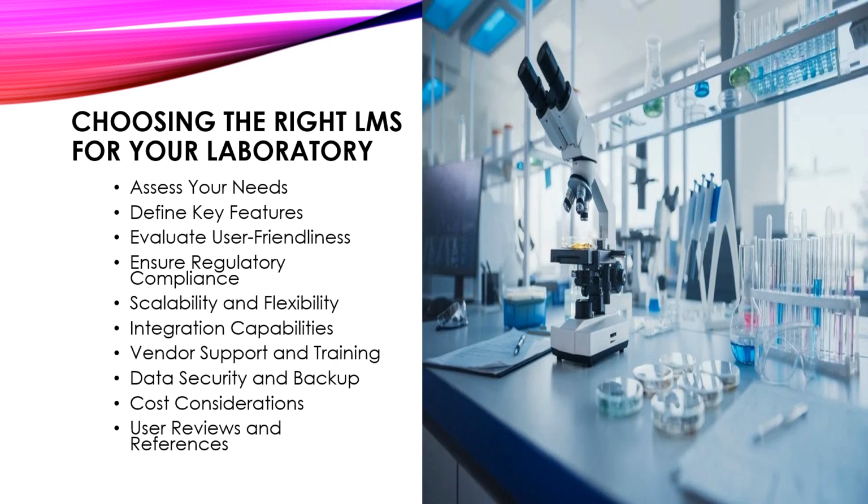The next is define key features. Make a list of key features and functionalities you require in a laboratory management system. Now, this could include sample tracking, data management, instrument integration, reporting capabilities, quality control management, and regulatory compliance features.